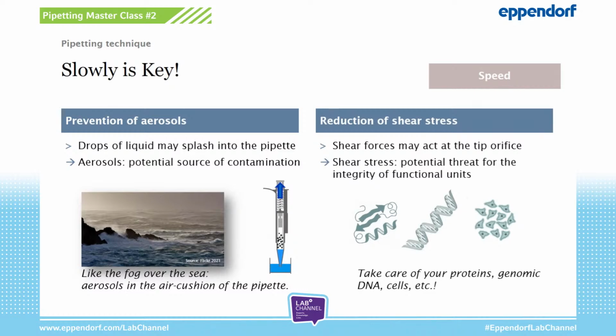Contamination can occur with any liquid movement, so through direct liquid transfers because of splashing or when we are touching the vessel wall, but also through aerosols, which can transport contaminating or even infectious particles. These particles are then drawn into the pipette cone during the pipetting process and settle there. During the next dosing, they can be mobilized again and distributed through the airflow.